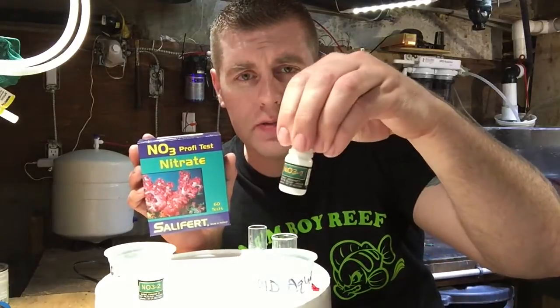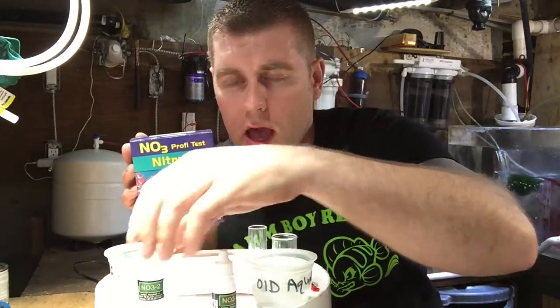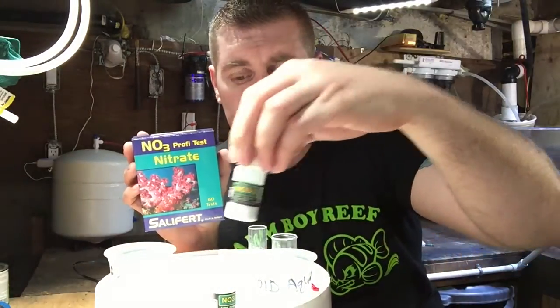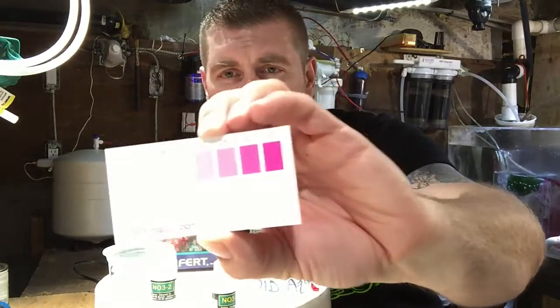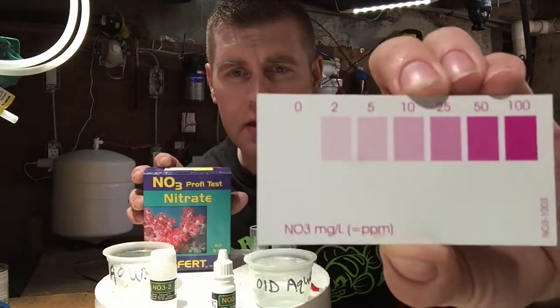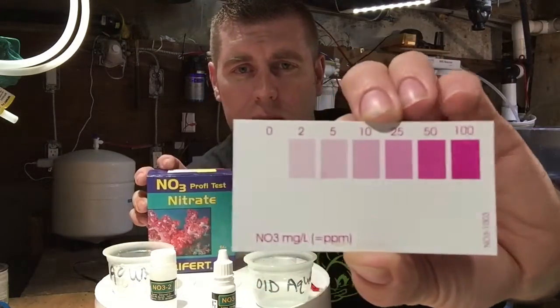What comes in the box: we have a solution and we're going to be using four drops of solution NO3-1, and we have the powder as well that we're going to mix. It also comes with a color guide chart — that's what we're going to put our test samples up against.